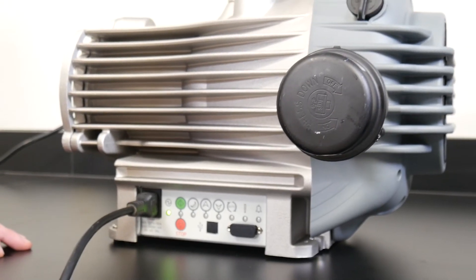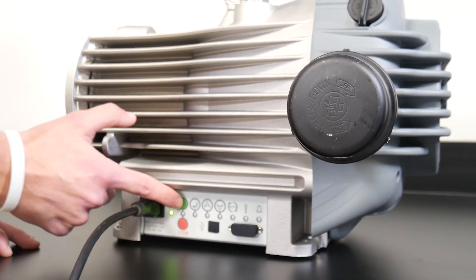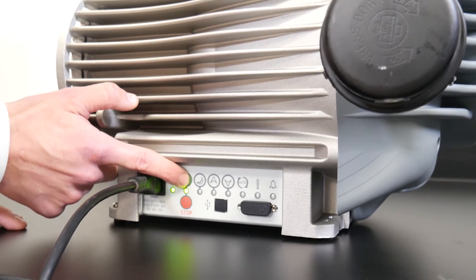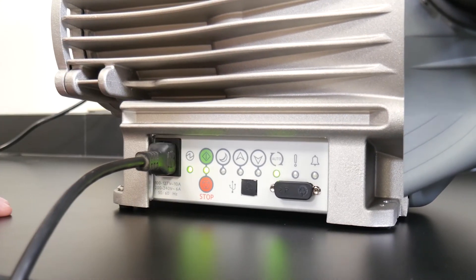Turn the vacuum pump power switch on by pressing the green start button. Press the green start button again and hold it for 10 seconds until the green auto indicator light illuminates. This allows your CentriVap or FreeZone freeze dryer to automatically control your vacuum pump.